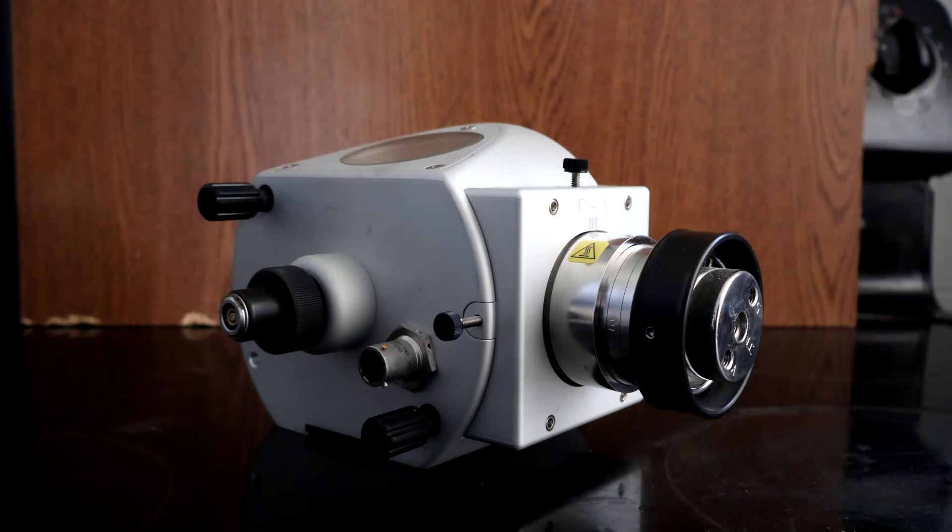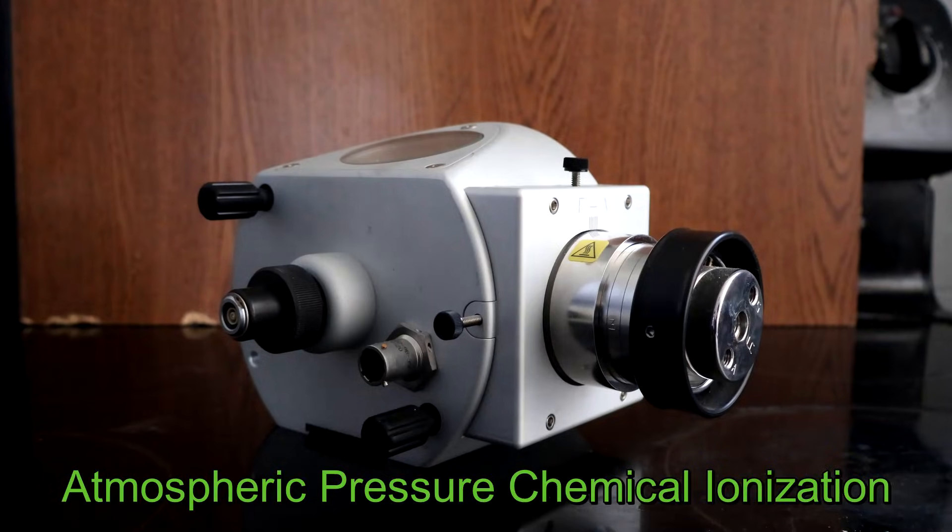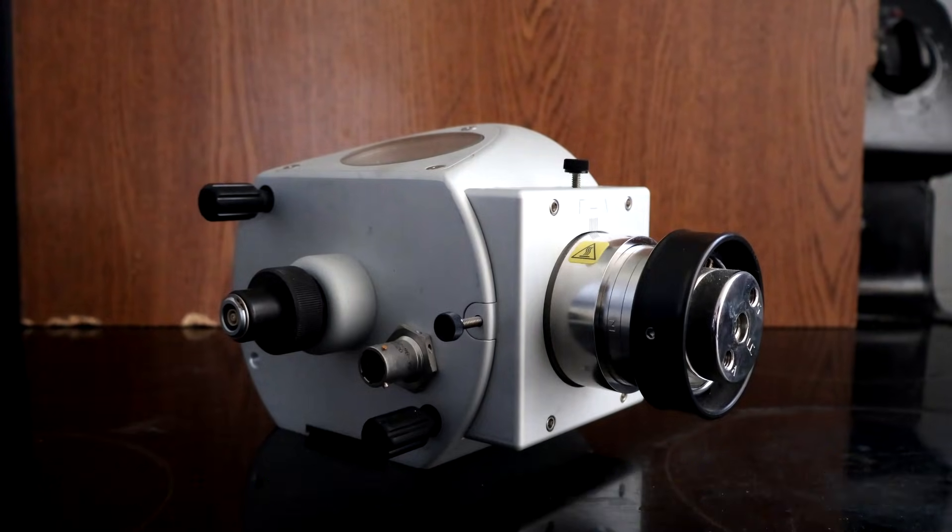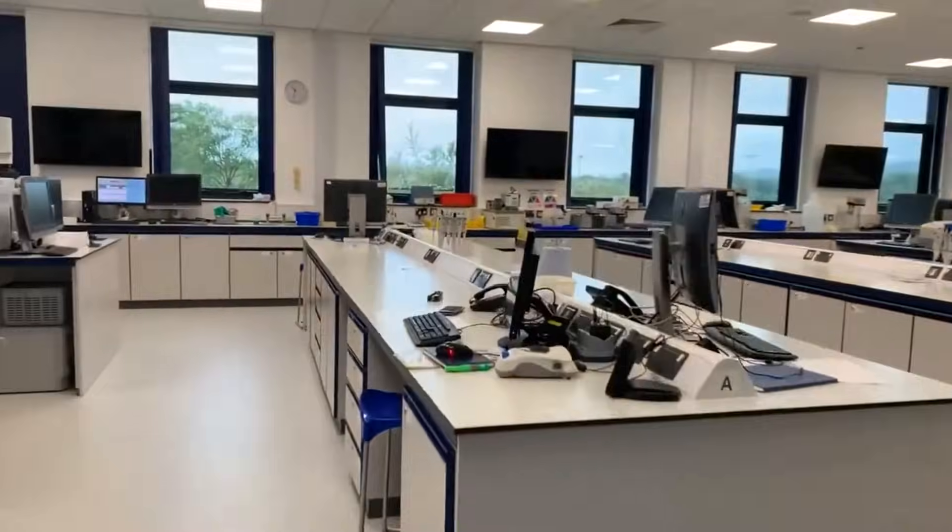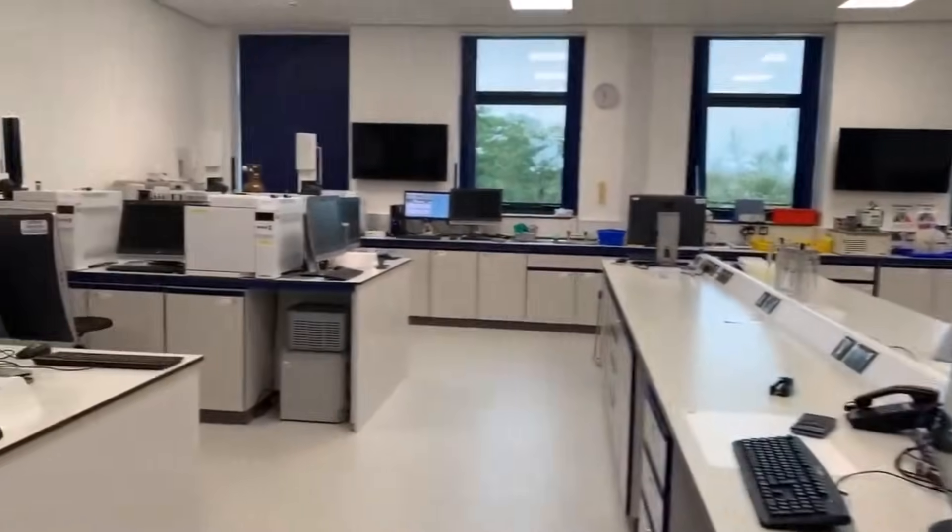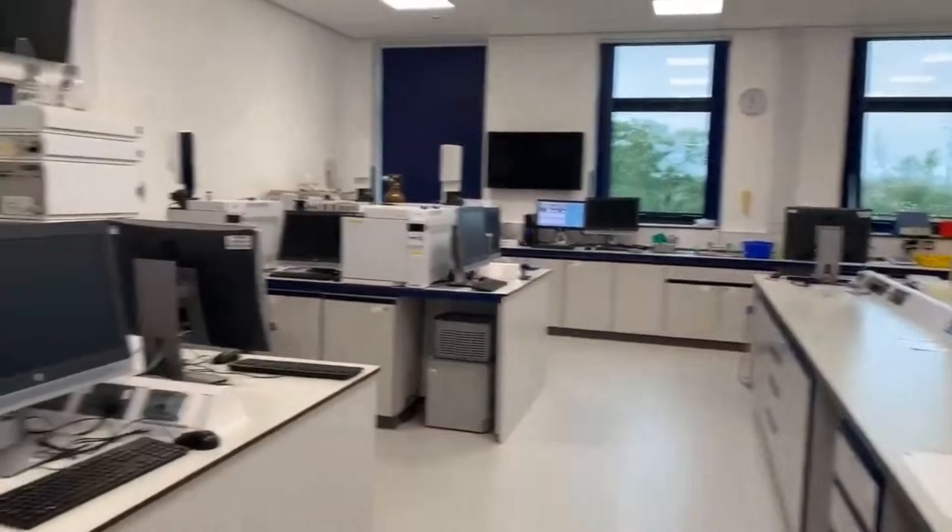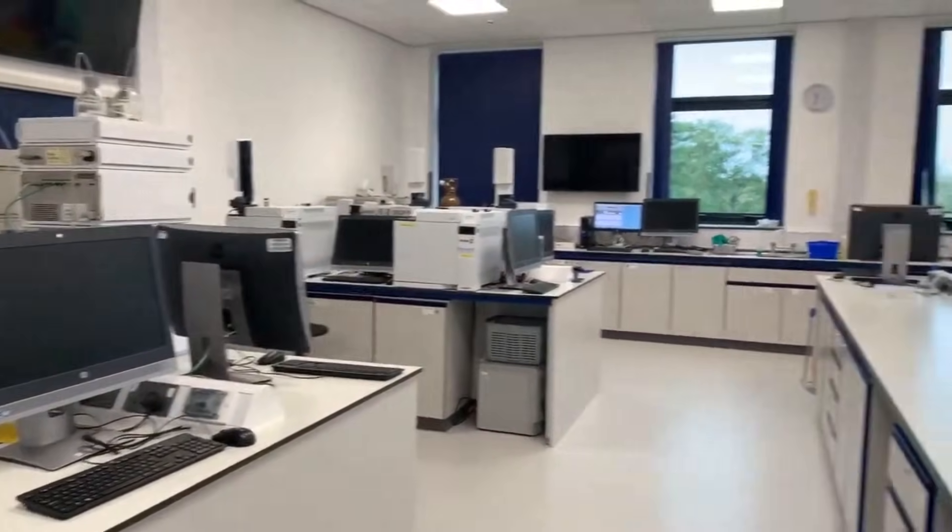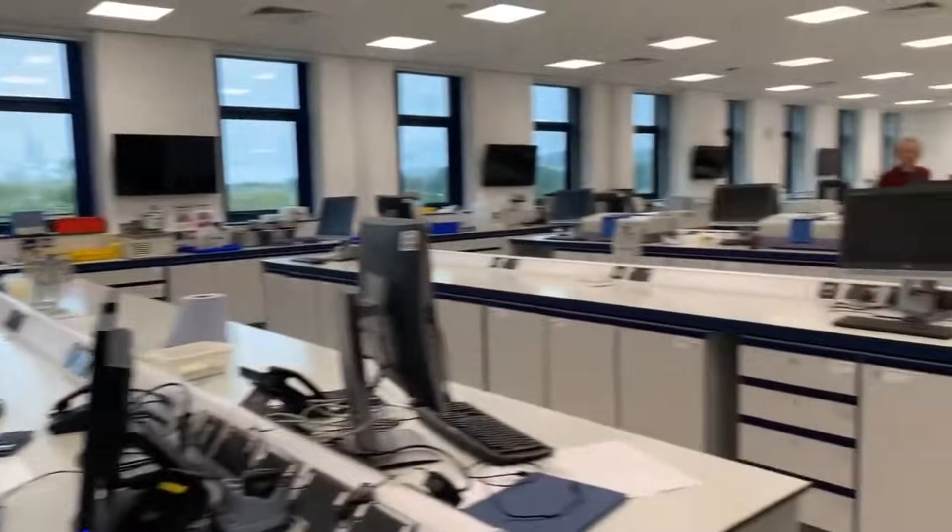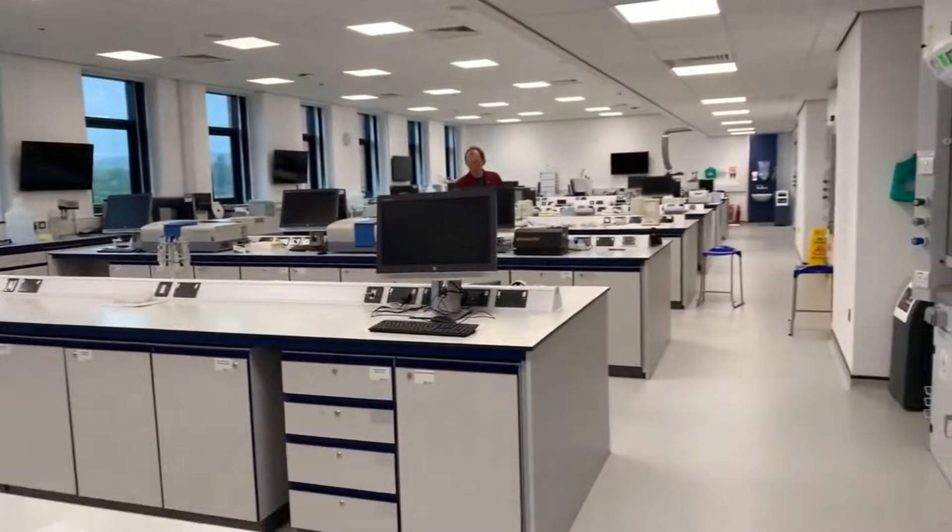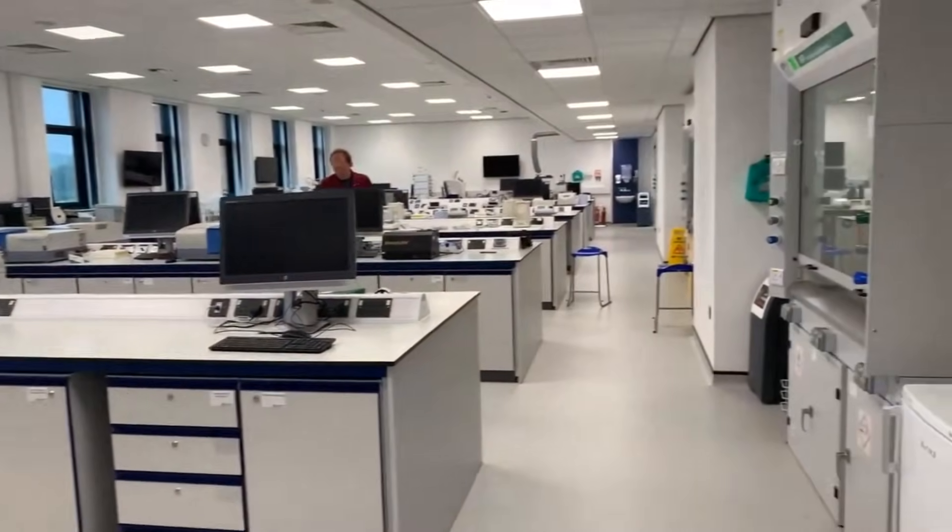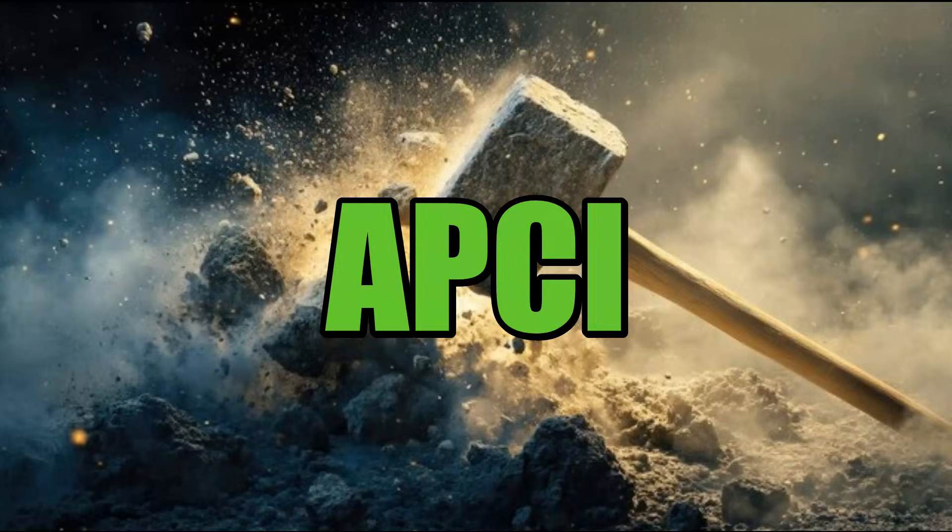The APCI for atmospheric pressure chemical ionization works for all sorts of polarity but does better with lower masses. ESI is better for heat-sensitive compounds with low volatility, while APCI is more attractive for single-charge ions and less sensitive to flow and pH changes and tolerates a wide range of matrix. Basically, ESI is for delicate sensitive stuff and APCI for everything else.